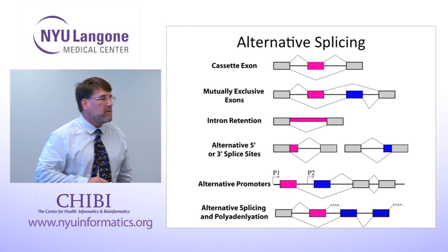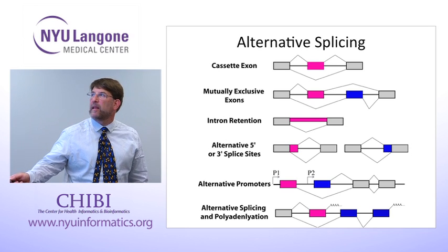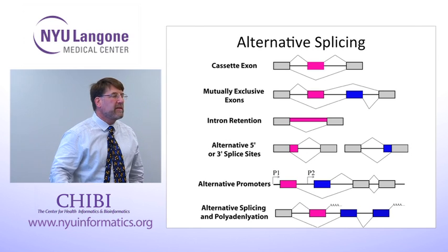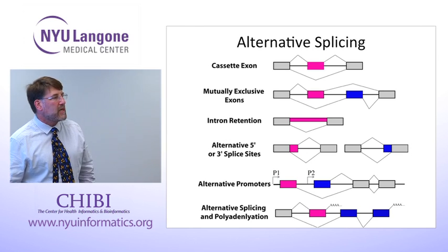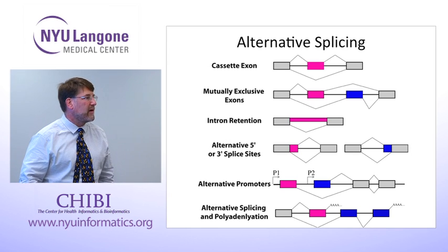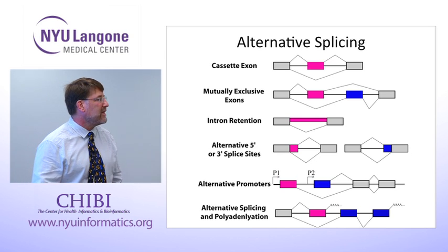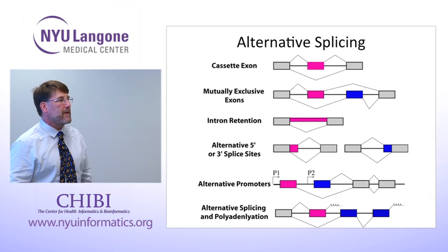To some extent, we can differentiate these. Certainly in the case of this purple exon, or in a read that skips it, we could tell the difference based on the number of reads on this exon. We can say, yes, this exon is expressed at twice the level of this one. Alternative splicing exists in this system. We see at least 2 or maybe 3 or 5 different transcript types.